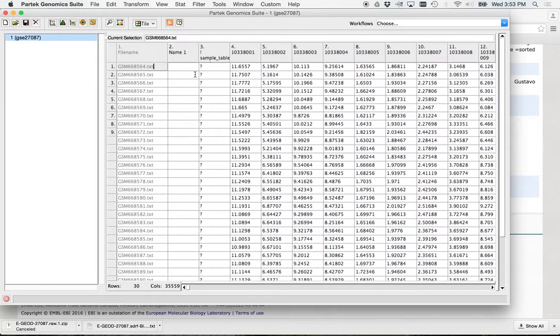Yeah, GEO, totally. Actually, we're not going to get it from GEO because GEO sucks. We're going to go to the European version. They're much nicer. They drink tea and you're just happier people. GEO's horrible. So we're going to need a sample table, and we're going to need to take that information and merge it to this, correct? I'm going to teach you how to do that today.